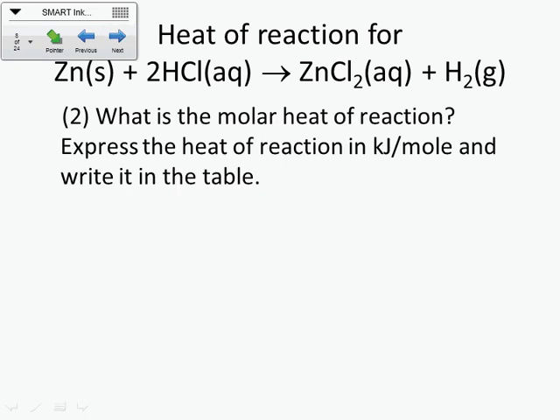Okay, so now the molar heat of reaction in kilojoules per mole. We have negative 760, negative 0.760 kilojoules. Is it okay if I do that in my head? Just swing the decimal over 3 places. Divided by, what was the number of moles? I forgot already. 0.00503.